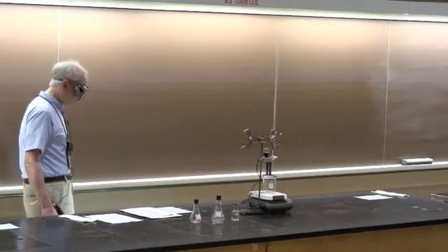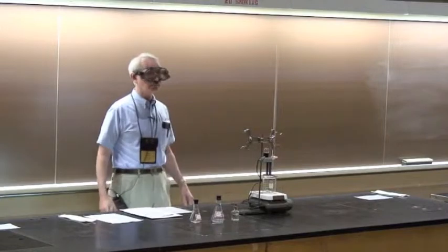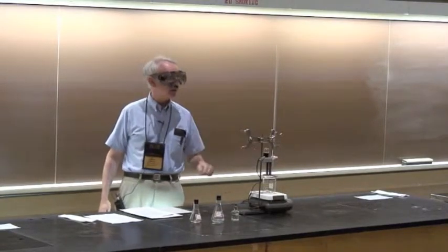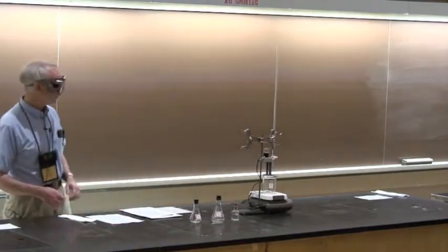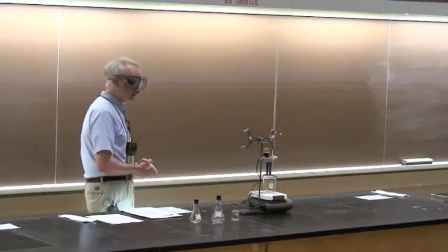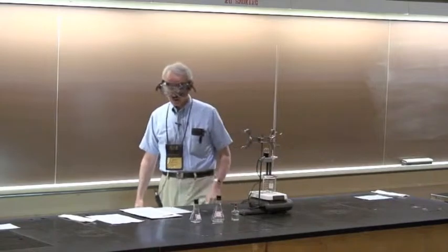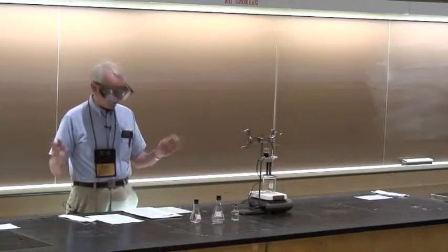I do this in general chemistry in the 5th week of the semester. Can everyone hear me? And students are familiar with the electrolyte light, which goes on when the solution is conducting electricity, which happens when there are ions in solution. And by the 5th week, I know the names of my students. I have about 60 or so. So I will be calling on you by name. It just won't be your name.